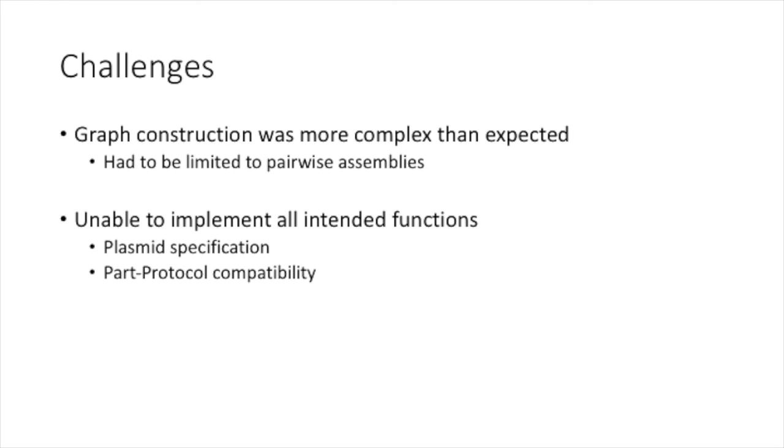Nevertheless, we believe that our tool serves as proof that our concept works, and that a fully implemented tool would be useful to anyone looking to carry out DNA assembly.